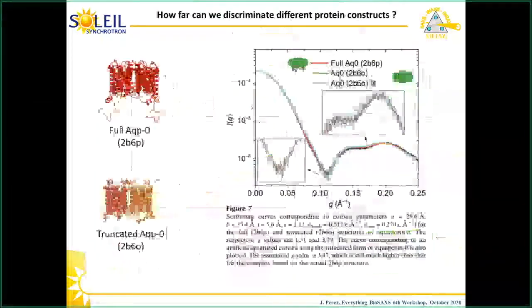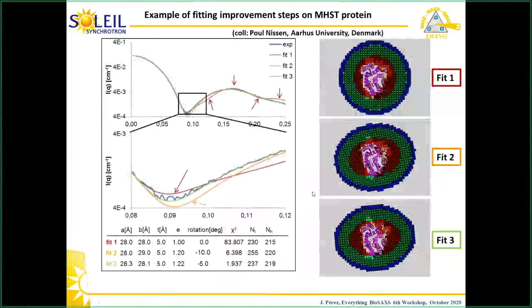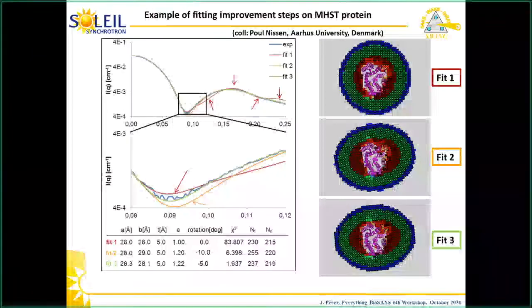So we have a question about Memprot, which is, can Memprot be adapted for a corona of glycans, such as for mucin? Do you mean a corona of glycans? Yeah, a corona of glycans. Oh, yes. Then it's a matter of defining the correct density.